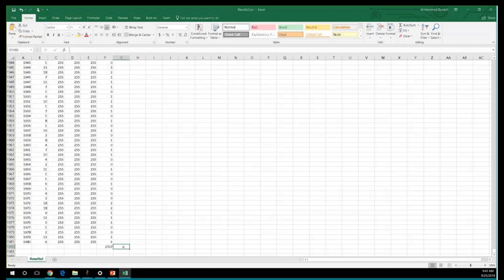And then you're going to take that number and divide it by the number of nuclei that we found in the first step. So I think it was 600 something. So it's going to be this number divided by, I think, 614 or something like that. And this will be the average copies per cell that you found.